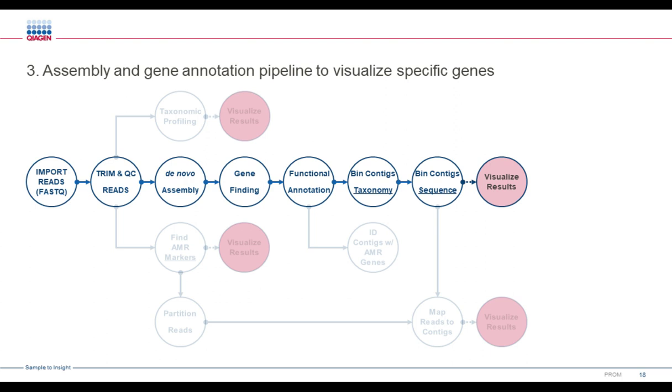And so in our workflow, we apply both binning approaches in serial. First, binning out contigs that have a high level of similarity to reference genomes in our database. The default settings that we use are a 90% cutoff. So in other words, individual contigs need to be present in the taxonomic classification database at a 90% level of identity or higher.